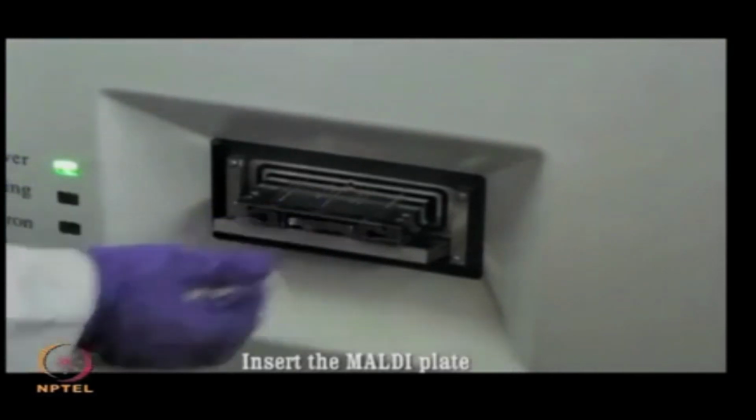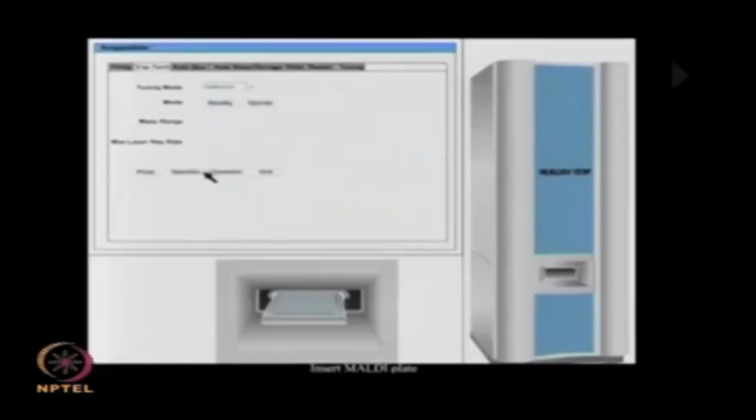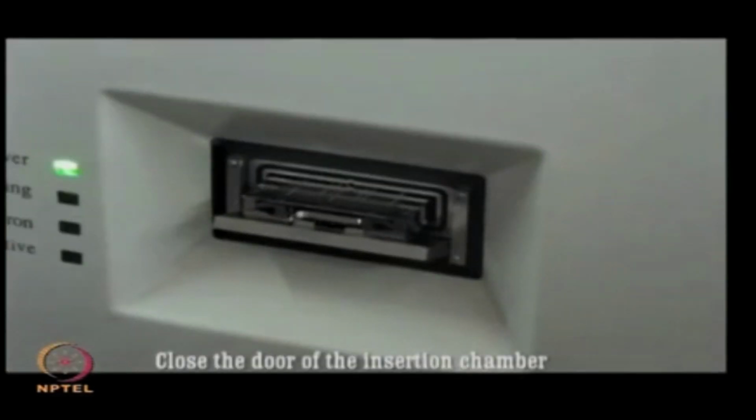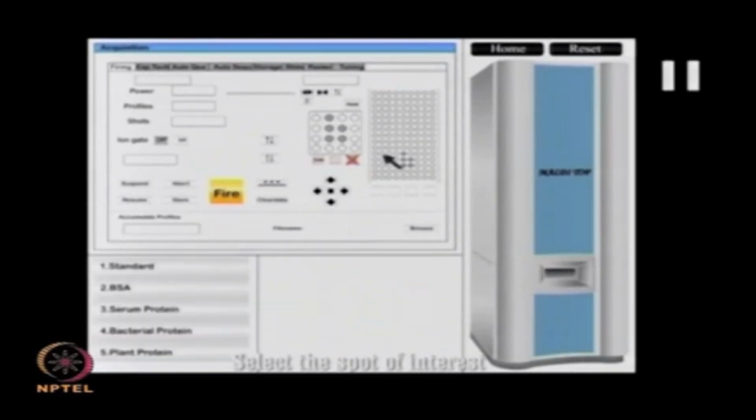Insert the MALDI target plate, face up with the cutoff corner to the front, and now by using the software, close the door. The door of the insertion chamber is now closed. You can select the plate, view the overall plate on the screen and then select the spot which you want to analyze. So, click on the yellow target in the acquisition window and select go to the location.